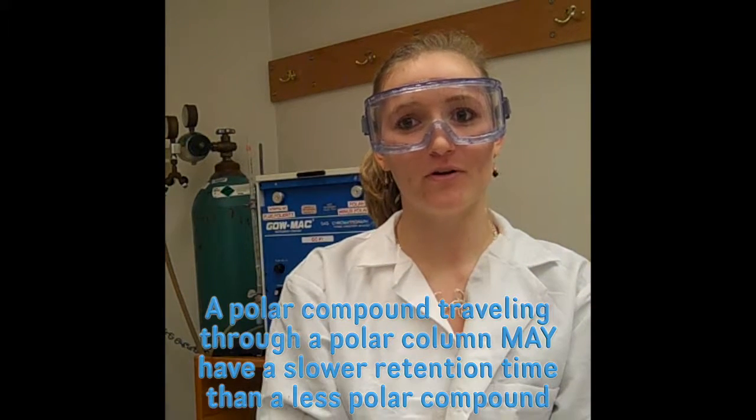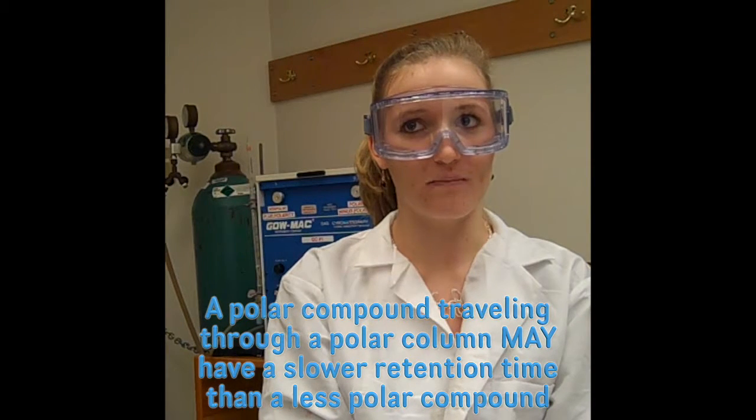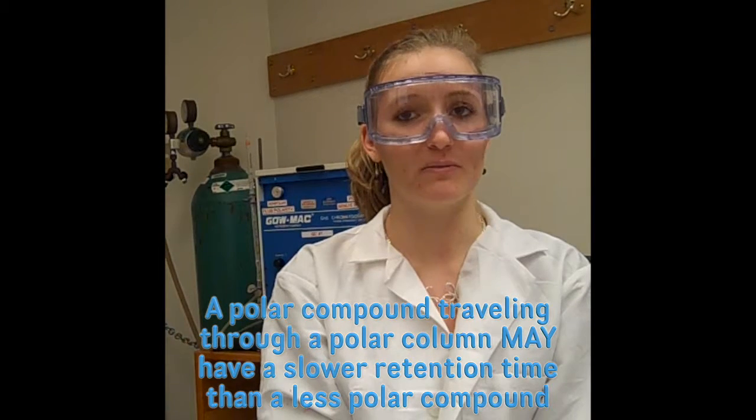The polarity of a compound and its column also affect the retention rate. Depending on the type of the stationary phase in the column, polar or nonpolar, and the polarity of the compounds in the mixture, each compound will elute at different rates. For example, a polar compound in the polar column will have a slower retention rate than the nonpolar compound in the same column because this polar compound interacts more strongly with the polar stationary phase.